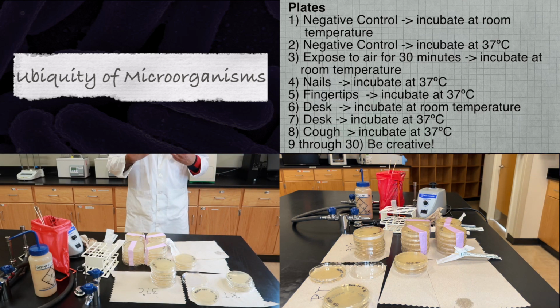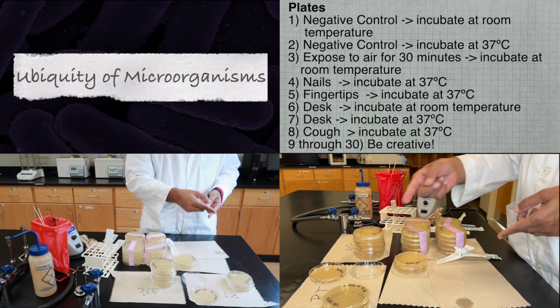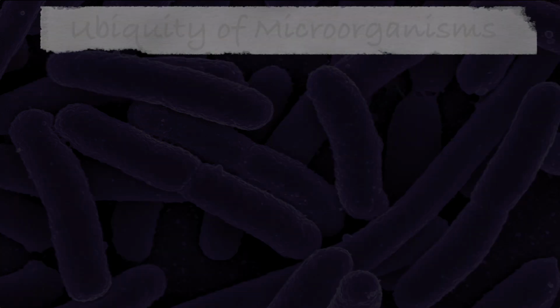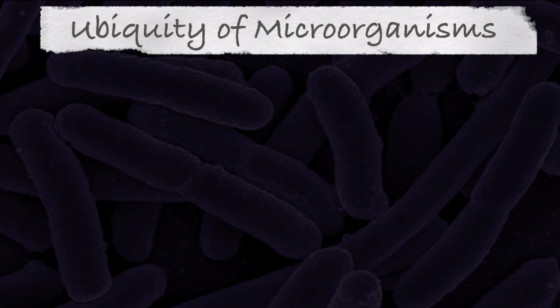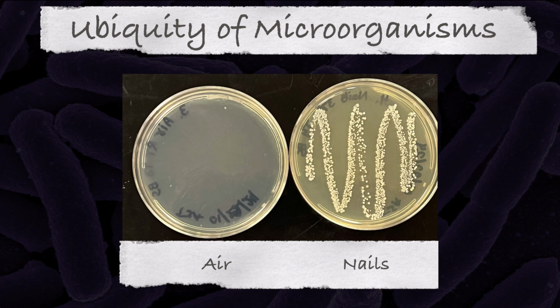For plates 9 through 30, you choose where to take the samples from and what temperature to incubate them at. Please feel free to be creative. At the end of this experiment, you will place the plates into either the room temperature or the 37 degree incubator. When you return during your next class session, you will then examine the plates for growth of microorganisms.